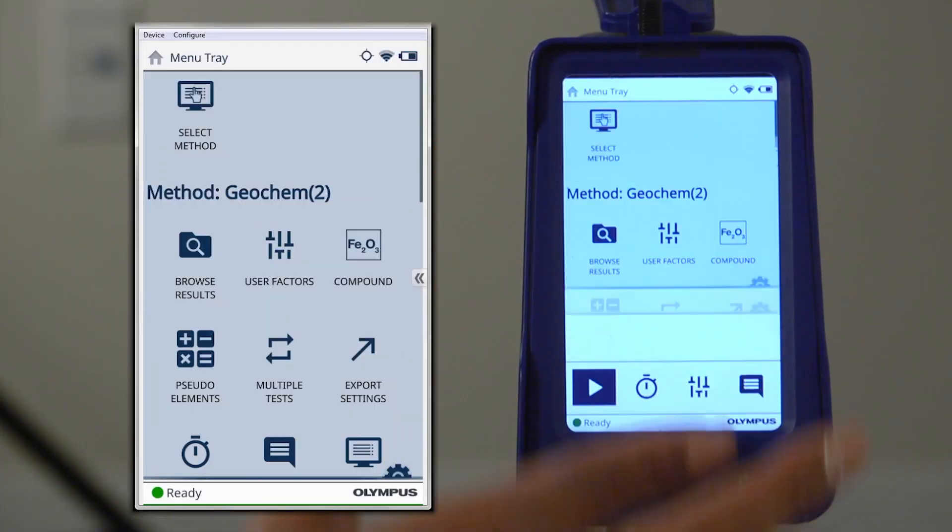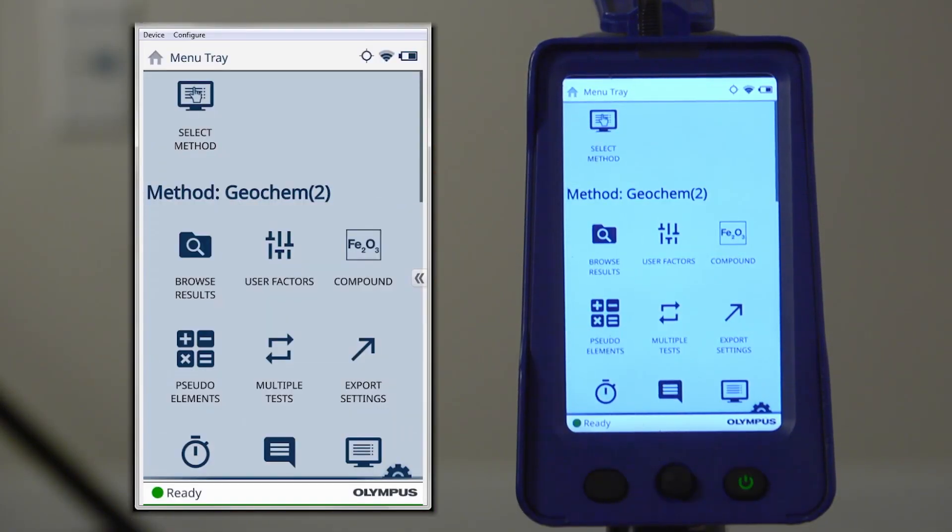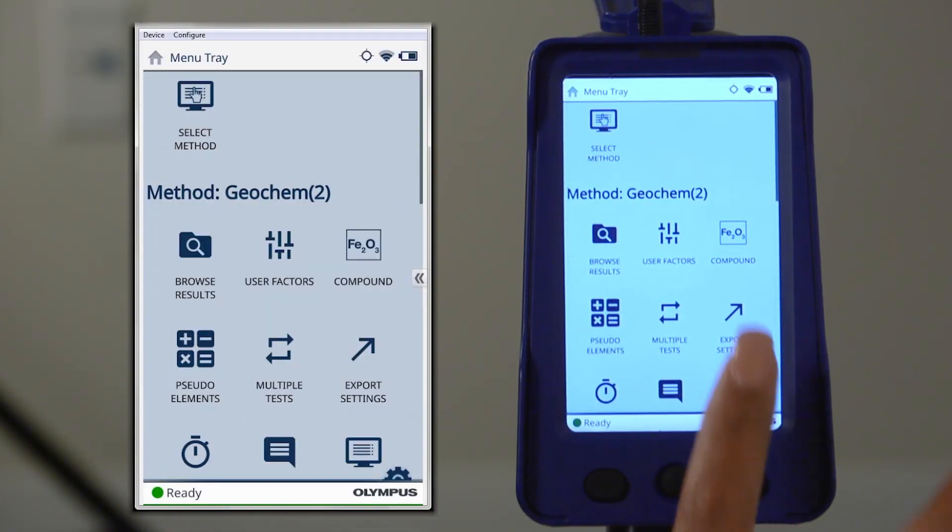To access this feature, we will pull down the menu tray and we will select the compounds icon.